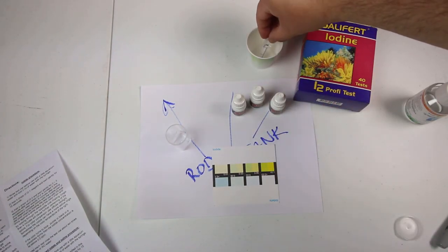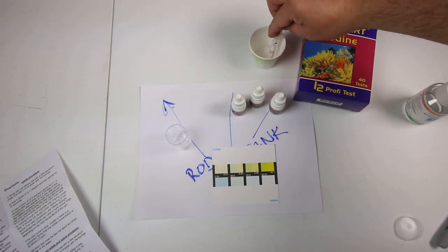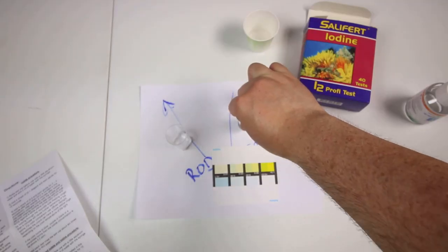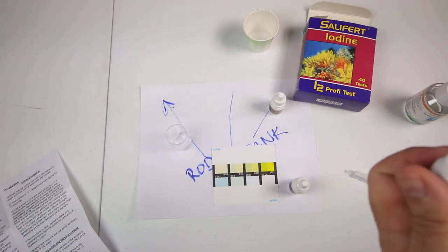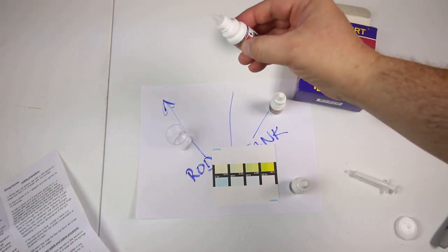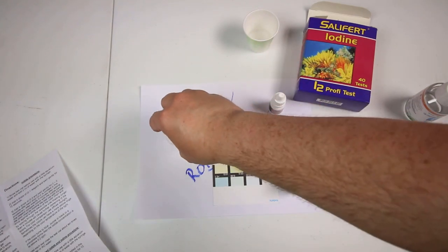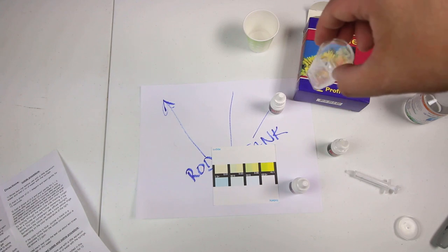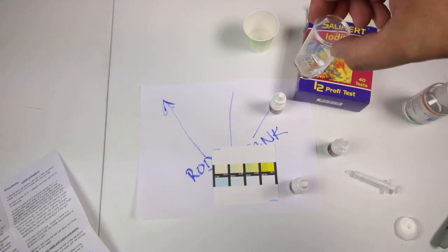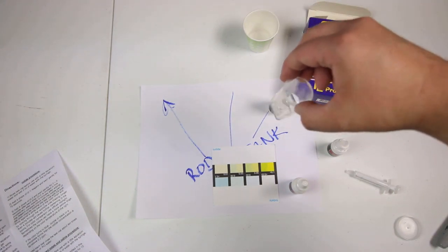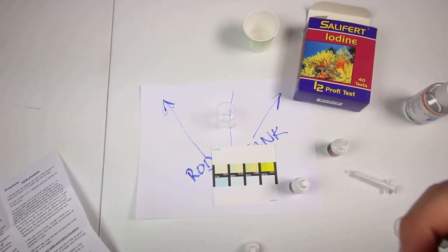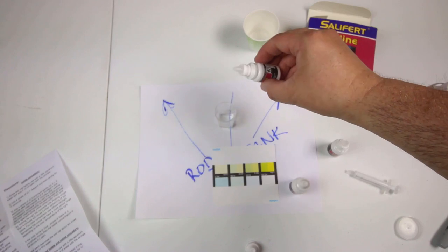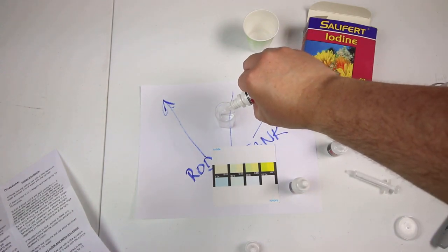Okay so for iodine we are going to be doing one milliliter of water from our tank and then we will add one drop of number two. One drop and then we're going to gently swirl for 10 seconds. This is actually a super simple test kit. It takes no time at all, 10 seconds, and then we are going to add four drops of the number three. After four drops is done we're going to gently swirl for 10 seconds and then let it stand for three minutes.